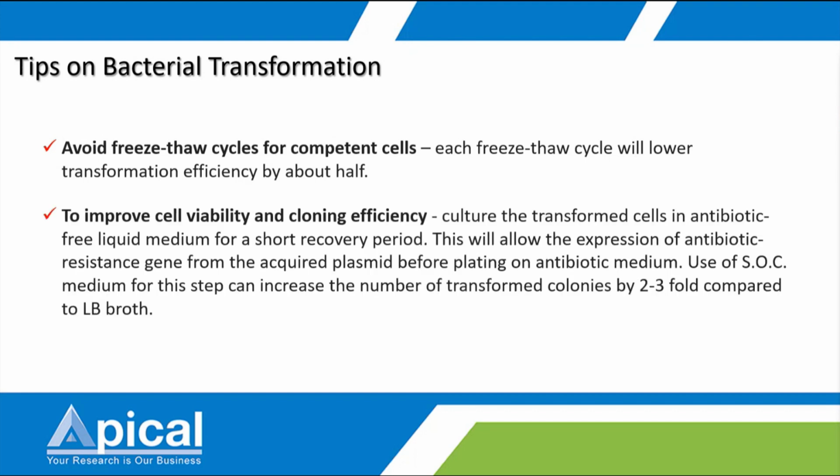Also, to improve the cell viability and the cloning efficiency, you can culture the transformed cells in an antibiotic-free liquid medium for a short recovery period, like half an hour. After the transformation, you culture the competent cells in something like 500 microliters of culture for a short period.